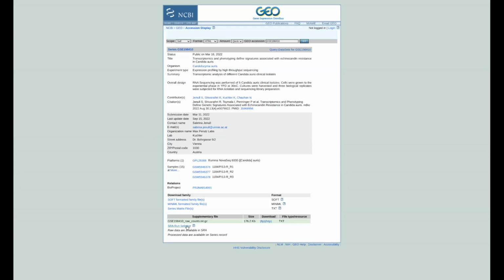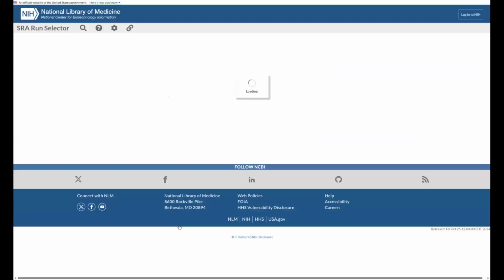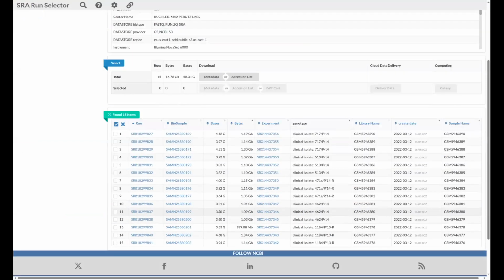Usually you look around this page and you will find the actual data, in this case the Illumina underlying data sets for this particular study. As with most studies, there is a bit of confusion here because the paper says that it was paired-end data, but they submitted it as single-end data. There's always something like this, and not all the samples are labeled correctly, but I'll leave this on the conscience of the authors.